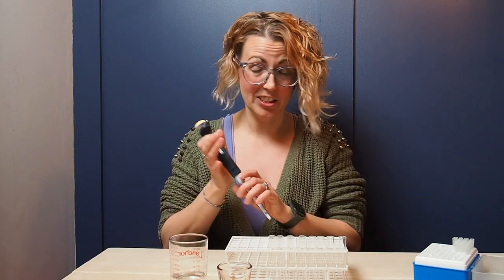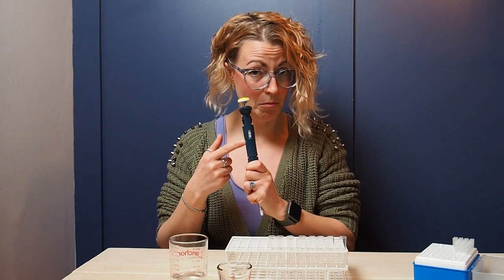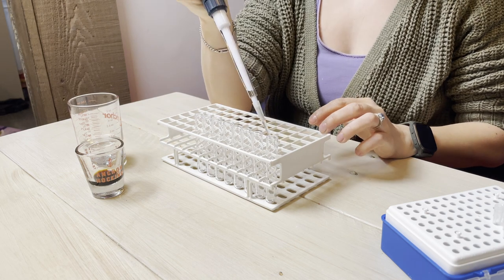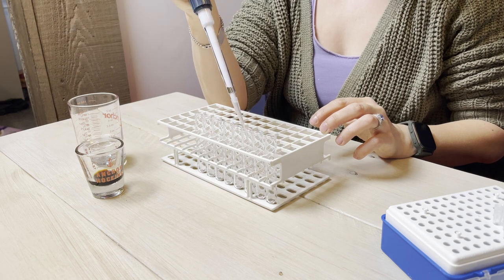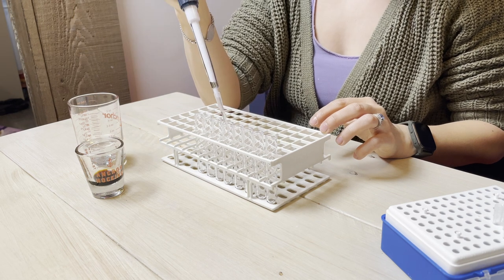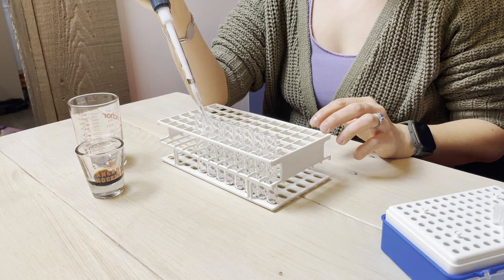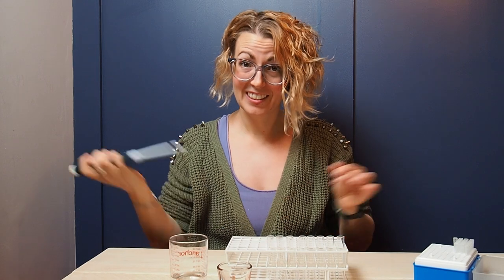For the first step of my titration, I'm going to set my pipette to whatever volume I want to have in my sample in the end. Today I want 100 microliters, so I'm going to pipette 100 microliters of my staining buffer into each of my tubes. And there we have it — staining buffer added.